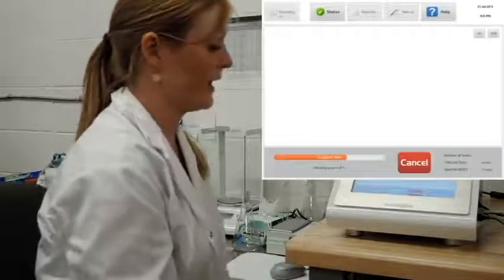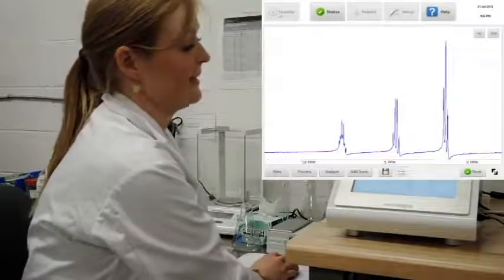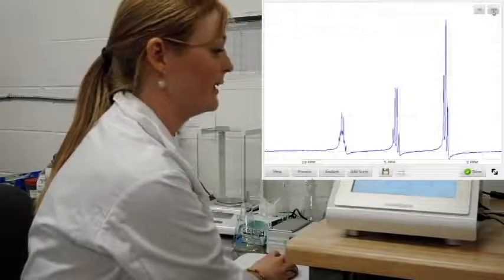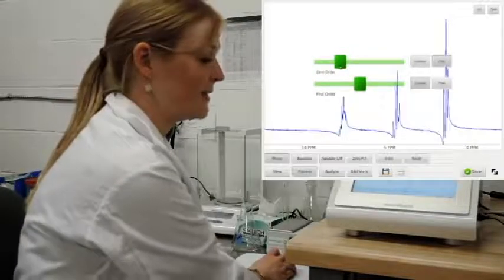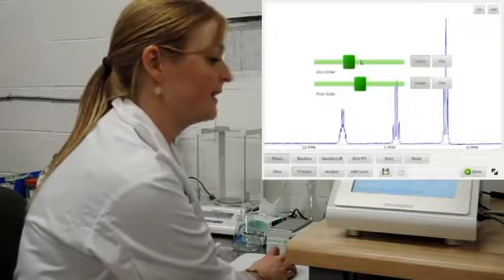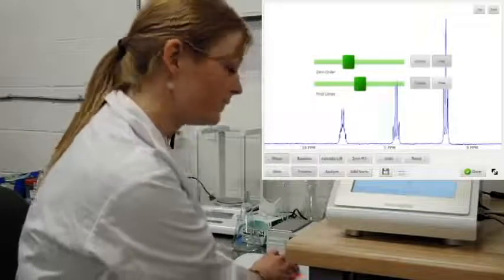The instrument performs an automatic receiver gain and then displays the spectrum. So you have some visualization options from here. You can make it full screen, you can put on a grid, but I'm going to go straight to processing. First I'm going to start by phasing. I can either use these green sliders and drag them, or I can choose coarse and fine adjustments and click in the light green bar for a little finer control of my phasing process.